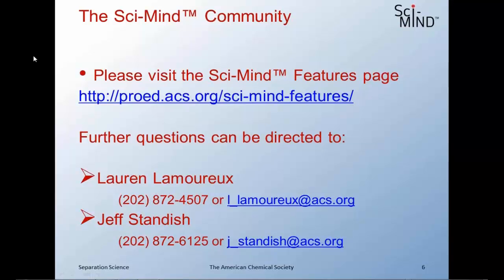Oh, super. So just to fill the subject matter experts in, due to our current government shutdown, a number of our learners who are government employed don't have access to their instruments. So out of the 5 people that we sent samples to, only 2 of them are going to be able to run it. So what I proposed to them by email today is that we just make this a community, a group lab exercise. When Chris and Kim get their chromatograms, they'll post them on the discussion thread, and then all the learners and SMEs will have a chance to look at the data and provide comments within the next 5 days or so. Sound good?